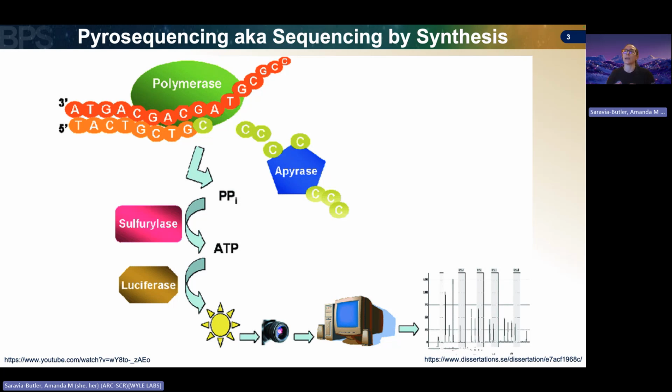That way we will know with each cycle, or each base of our unknown that's being sequenced, we will always have either the A, T, C, or G incorporated, depending on which complement is there. And the light signal that's released will be a specific color, and that's how we will know if it is an A, T, C, or G that was incorporated in that growing strand.